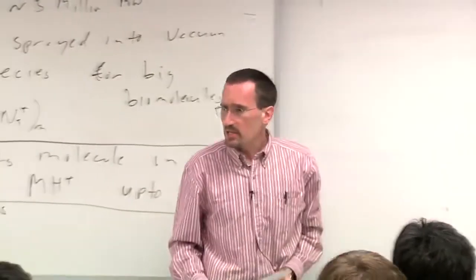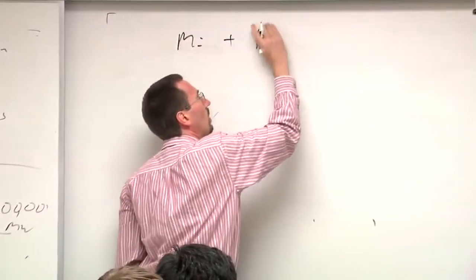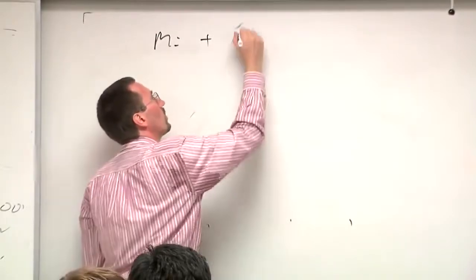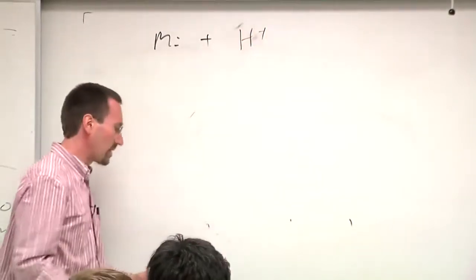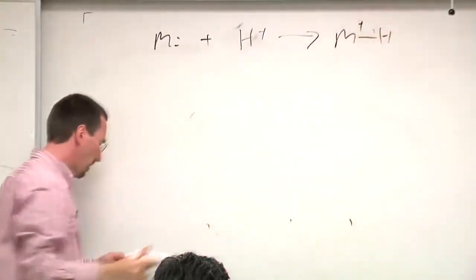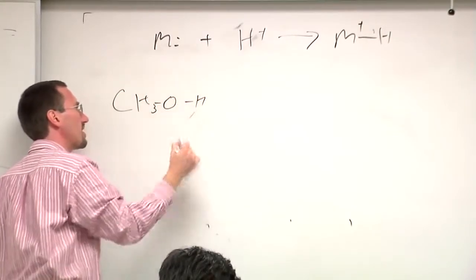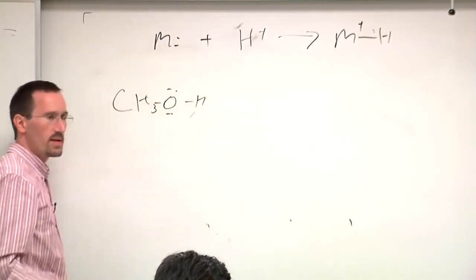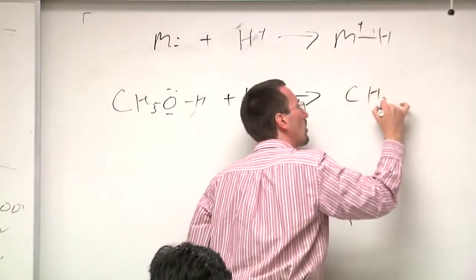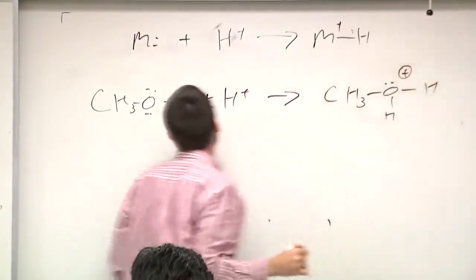As I said, in these soft ionization techniques, what you're doing is taking the molecule and putting a proton on it, or a sodium ion, to give you MH+, for example. I'll give you two trivial examples. You wouldn't typically look at methanol, but it's a nice simple way to think about it. If you put a proton on methanol, as I indicated before when I talked about diethyl ether, you will end up with protonated methanol.